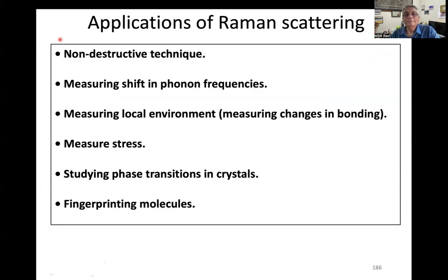Now, what are the applications? There are various applications. Of course, it's a non-destructive technique, and you can measure the shifts in phonon frequencies, the local environments, and changes in the way the bonding is affected by doping, pressure and temperature. All that can be recorded, as well as strain induced in the lattice, external or internal strain. Internal strain comes because of doping.